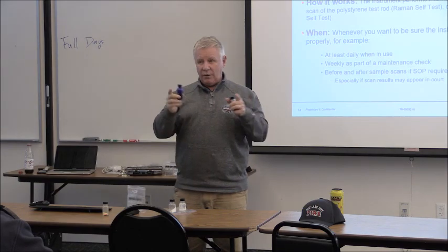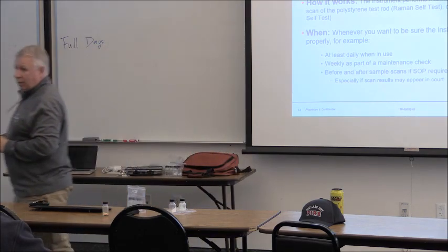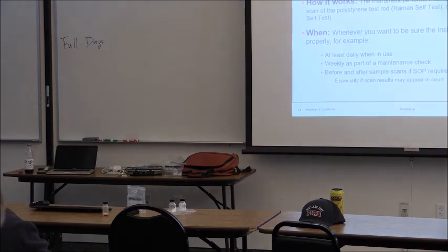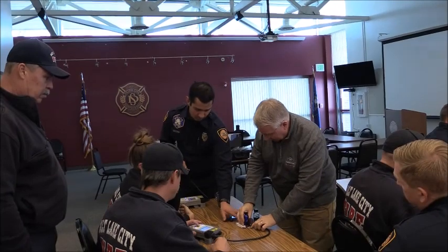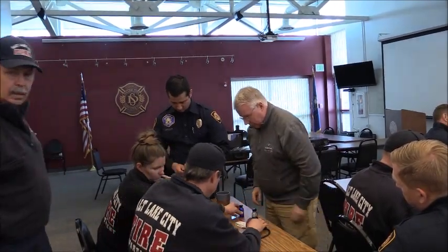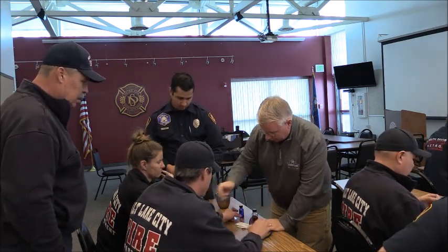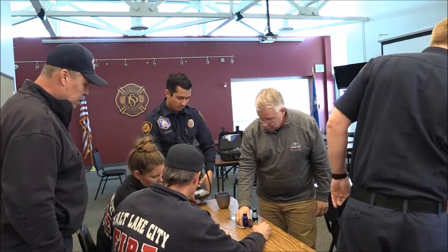So what I want you to do is run both of these with the Raman and see if one works, one doesn't, or if one's faster or slower. So try those. A lot of times, the only thing you have to do is, you see the liquid level is really low, make sure you get it in that liquid level. So on this, you could actually hold it like that to make sure it's in the liquid, or you could try setting it on something so you can get it to the right distance. So you want that right on there. So go ahead and press your scan key.